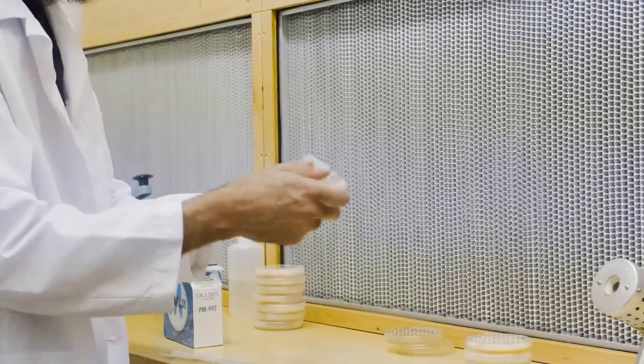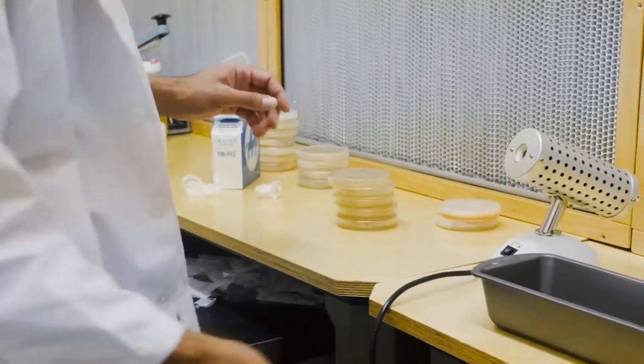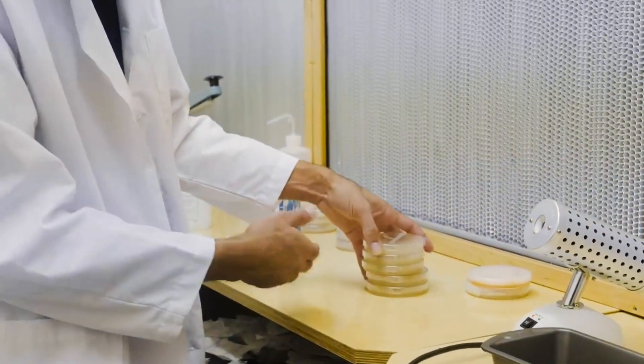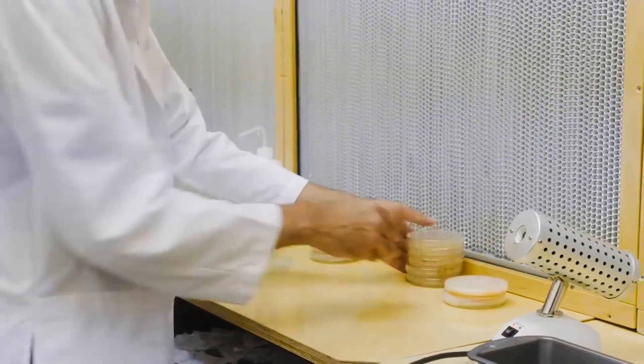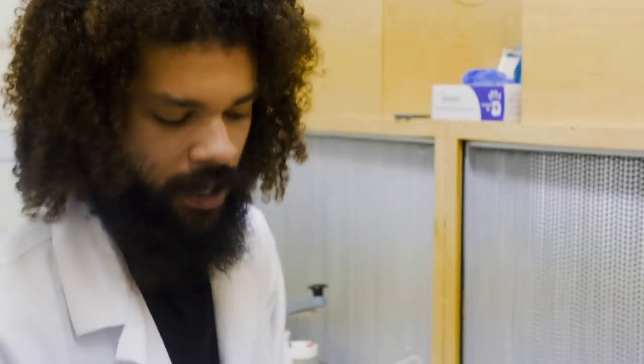If you can't get access to parafilm I've seen other people online use saran wrap. Every two to four weeks I'm in here transferring into new plates. Oftentimes you find yourself fruiting it within 10 days of inoculation to substrate.